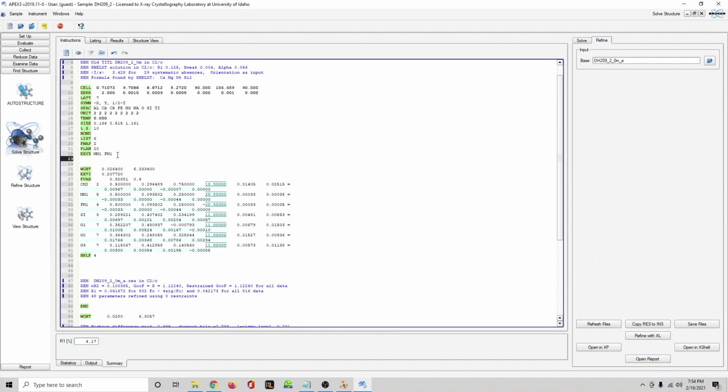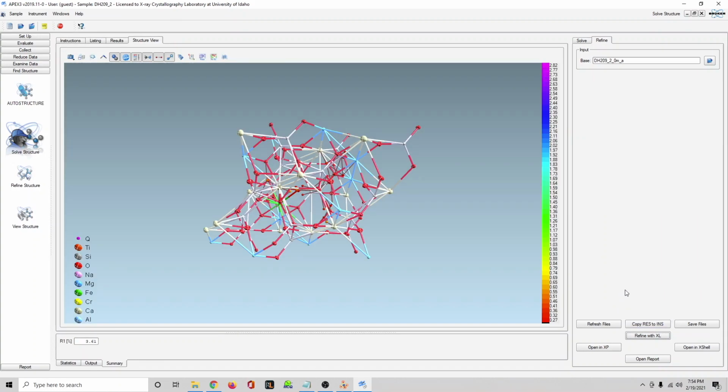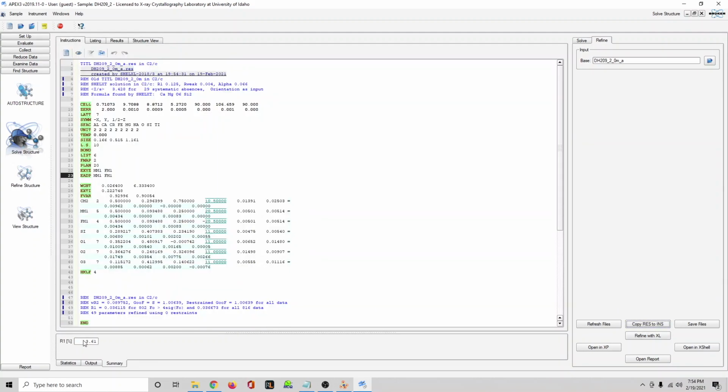Nor do we want it to change its atomic displacement parameters. So we will put EADP, atomic displacement parameter, for those same two elements. And we will now refine it. And it looks like I didn't forget anything. So we have modeled that, and we've dropped the R1 to 3.6. And essentially what this is telling me is my estimate from earlier was kind of correct: 10% iron, 90% magnesium in that site, more or less, just based on the contributions to electron density.